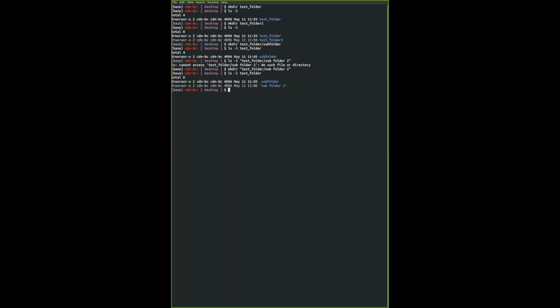Okay, I personally would like to advocate, if you're doing this more rigorously, to create file names without space, because sometimes you forget which files have space and which files do not have space. So you either have to put hyphen for everything or do not put hyphen for all of these functions. Okay. So I'm going to paste this set of code into Etherpad if you want to follow through and want to copy and paste. What about text files?